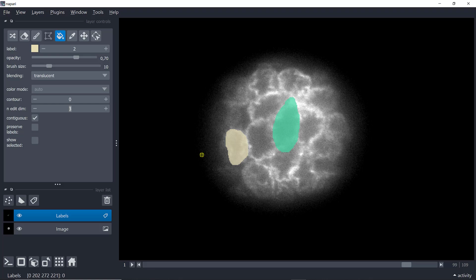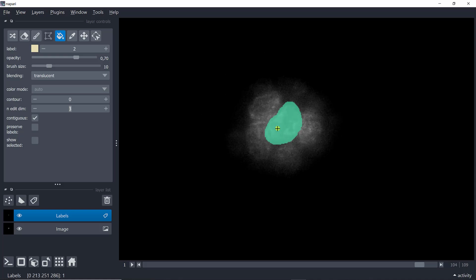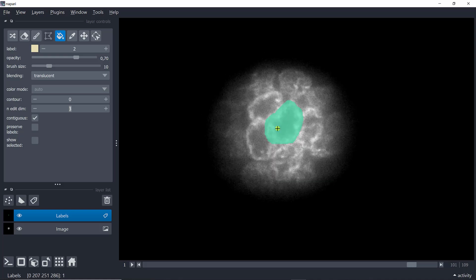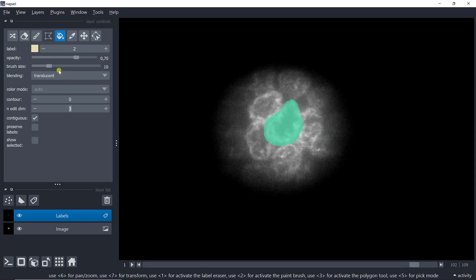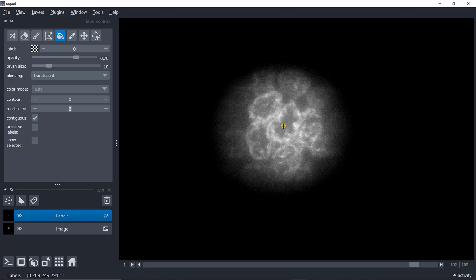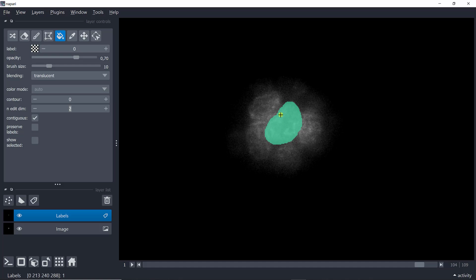It's also useful if I want to remove, so I'm going to show you here. For example, I'm going to go right in the middle, like in here. If I choose the 0 intensity and I fill this one in 2D edition, if I click on it, I removed it, but before and after it was not removed.